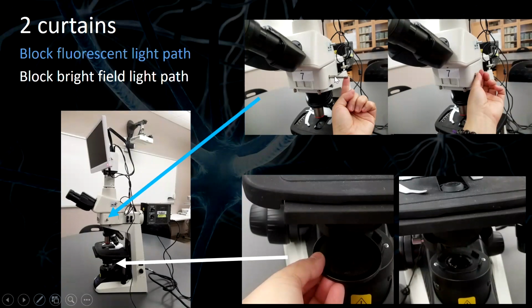By the side of the microscope, you see this bar. If you pull the bar out, you are going to close the curtain, which means there is going to be some light block that will block the light coming from this light box to your sample. And if you push that bar in, the light path will be cleared out. So you're going to have light coming through. Same thing for bright field. You have this cap.